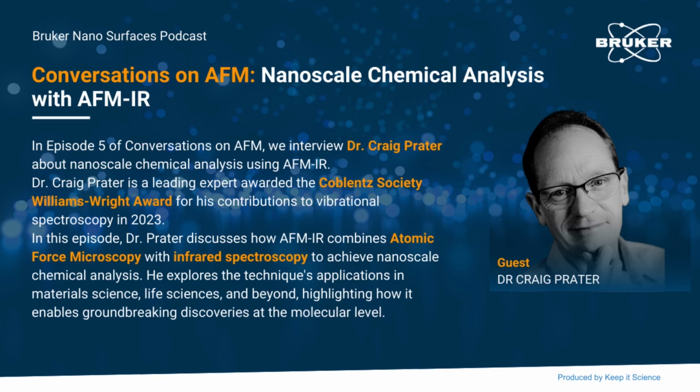Yeah, the history is really interesting. So as I mentioned, when I was working in the AFM industry, we had this long felt challenge to try to identify the material under the tip, and we tried a variety of different techniques that measured material properties without getting to chemistry.